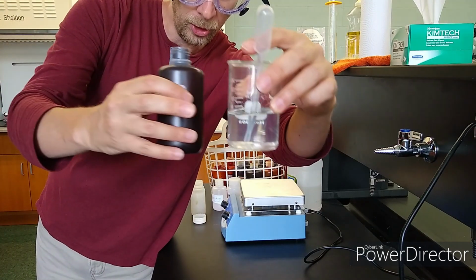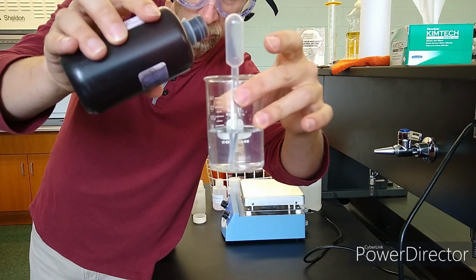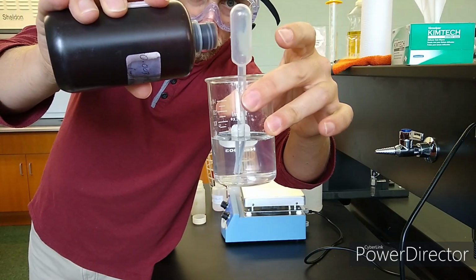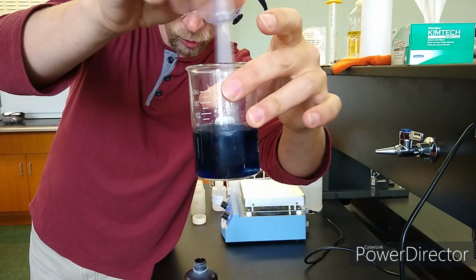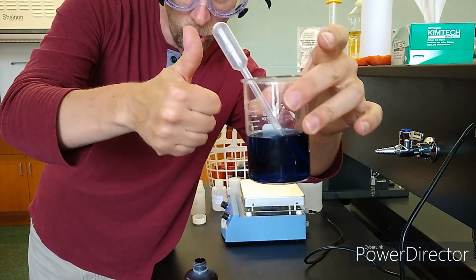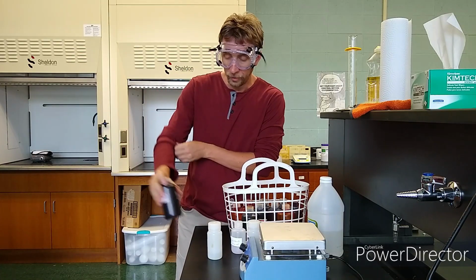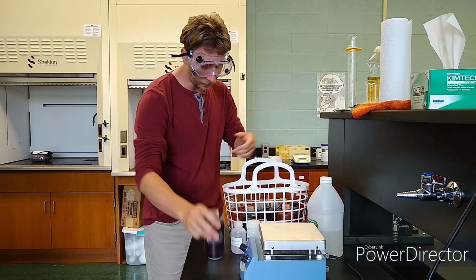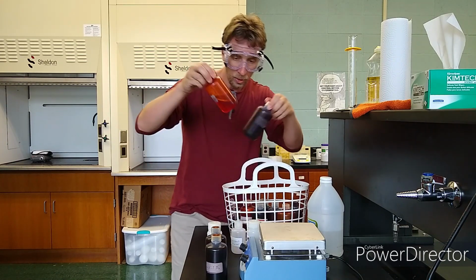If it's good starch, guess what will happen when I put in the iodine? Bing! Looks like it'll work. So next I got to decide whether or not I want to use this old iodine solution that has been in here since last trimester.